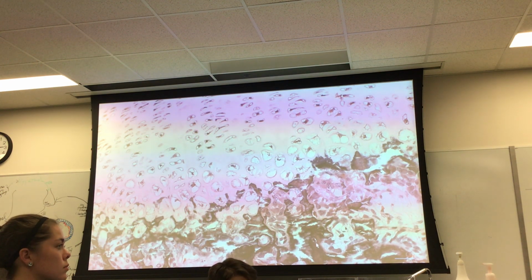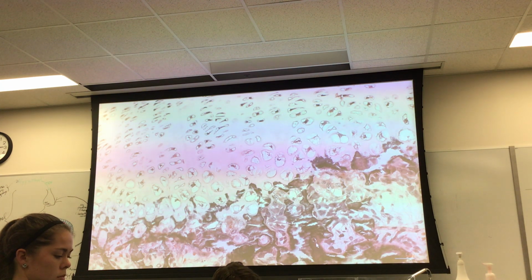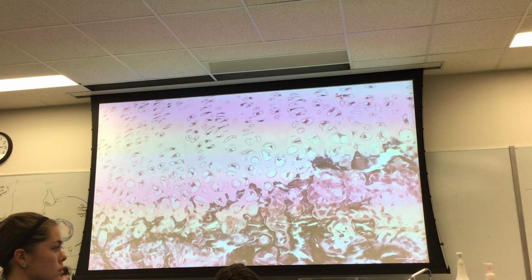So when it comes to bone, you have that dry ground preparation to look at. So take a look at those pictures. But most of them are the decalcified ones. We also looked at spicules and stuff like that. That was simply to illustrate the cell types.